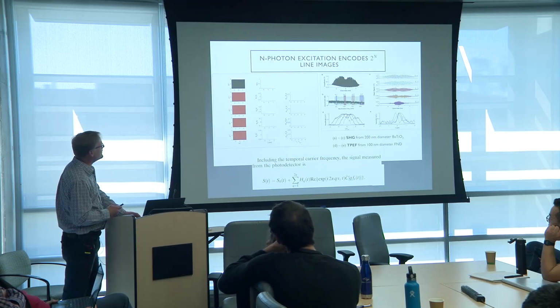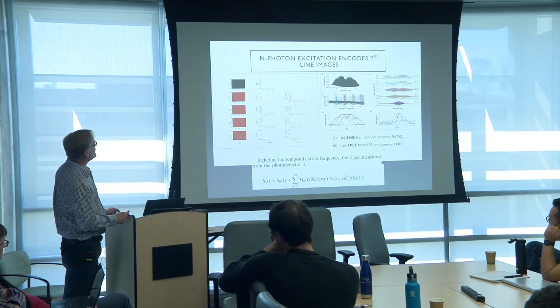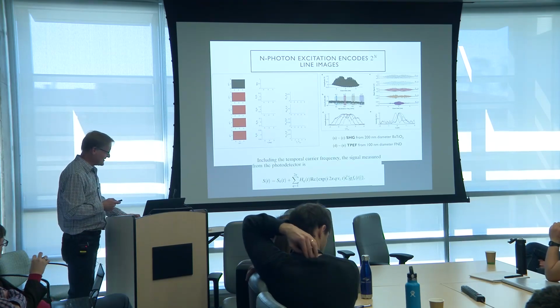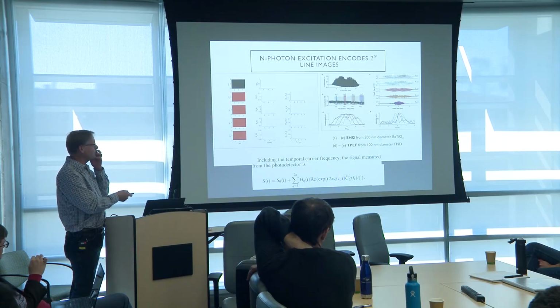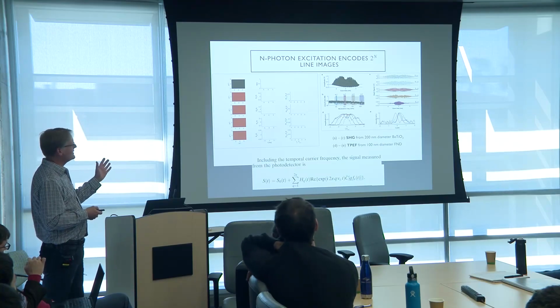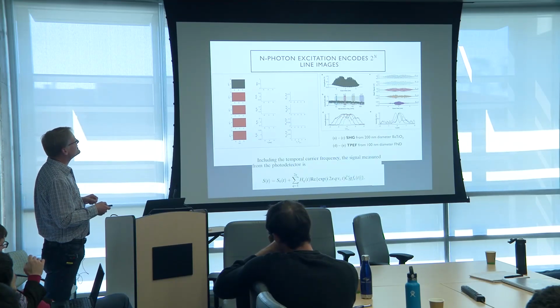So this is kind of the general term right here. This one's kind of complicated, and this one shows our original. It gets back to your point. Once we start going to higher intensities, this is our more general signal that we're going to detect, and this is where we can start pushing past the traditional resolution limits of all of these modalities.